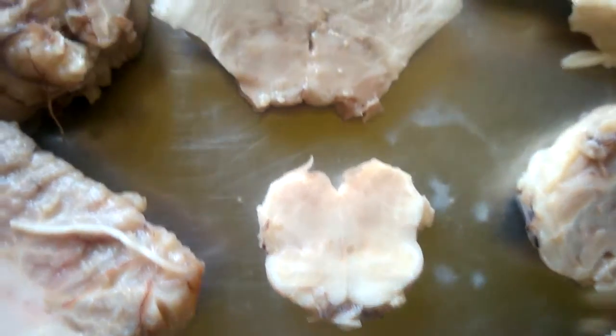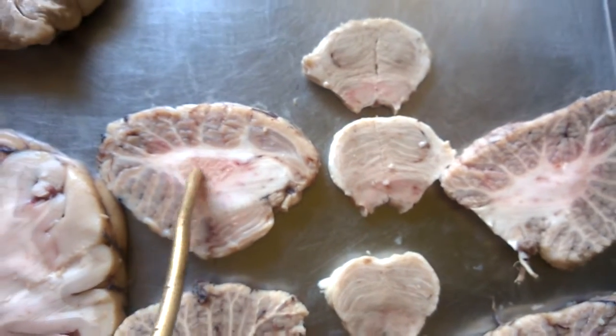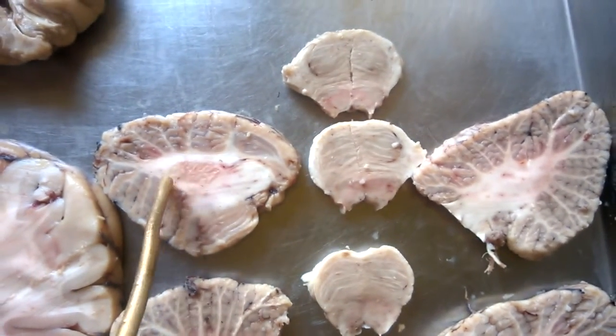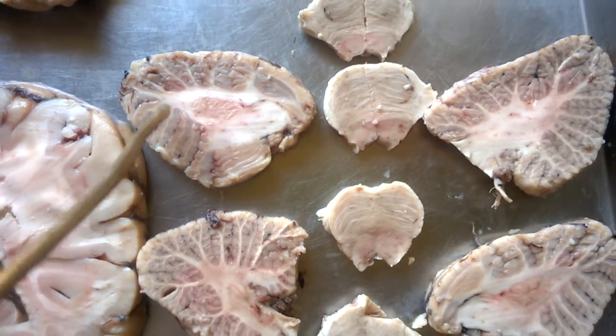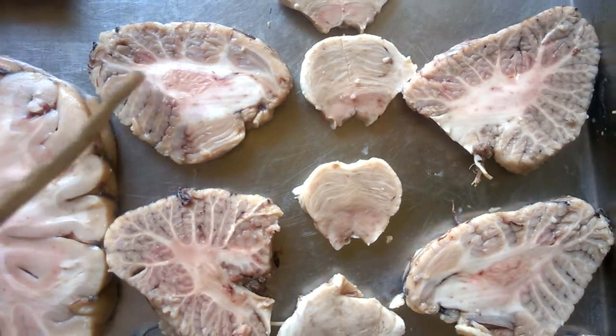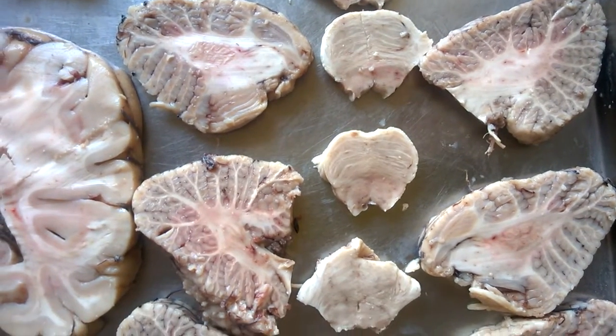And here this is the cerebellum, arranged on either side, and this crumbled appearance is the dentate nucleus, the largest nucleus of the cerebellum. The cerebellum has folia; the cortex is arranged as folia. It is very easily seen. So this is the dentate nucleus and the folia.